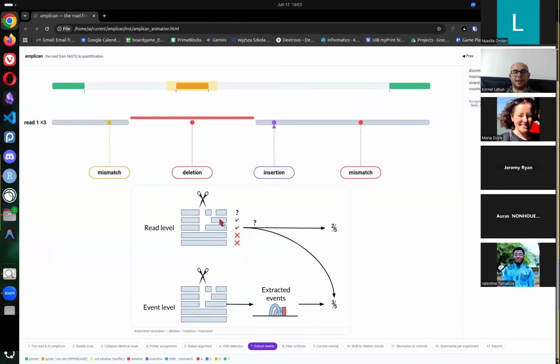You could call it some way of variant calling. So we call those variants in our reads, and then we perform operations on them. And we store variants in a table, basically, to make things simple. But these are not as complex as a normal variant caller with all possible structural variants and so on.